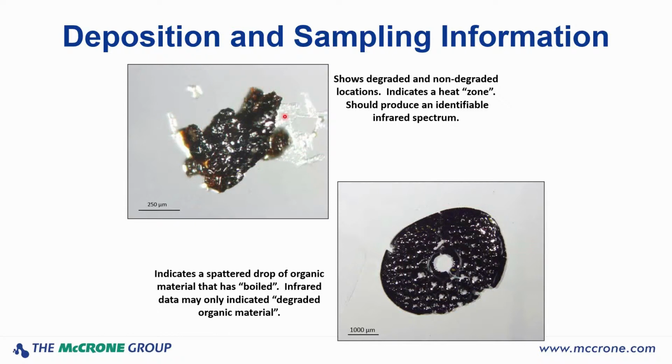These areas that are not charred are physically removed from a hot surface, so you don't have a lot of heat. Where you do have it, it's pretty intense because you melt and char here, but you still have areas that are unaffected. There's a heat sink effect of some type going on.